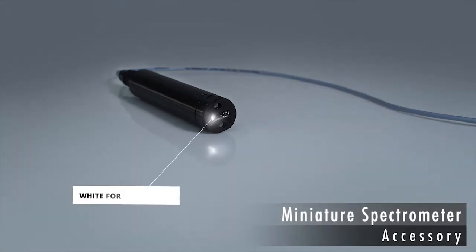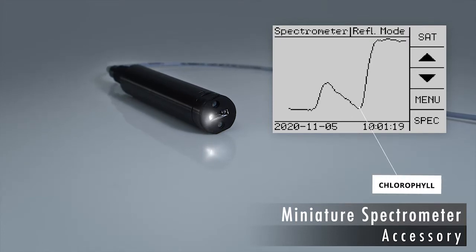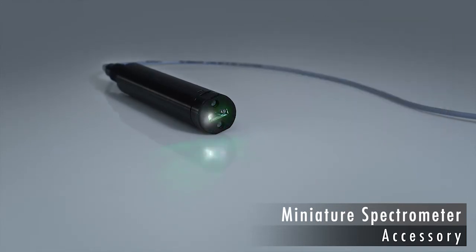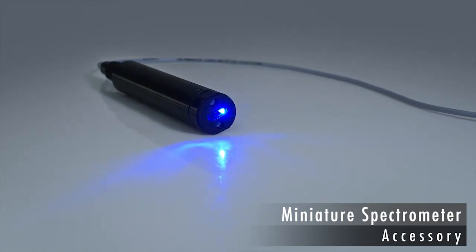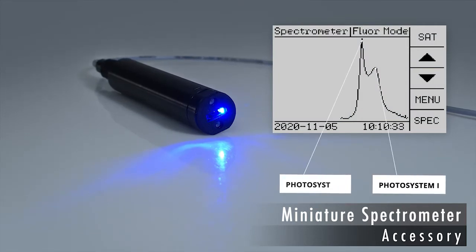The miniature spectrometer can be converted to measure spectra of reflectance or fluorescence emission. For reflectance measurements, a white light source is employed. Reflectance spectra resemble the inverse absorption spectrum of the leaf: the long-wavelength absorption of chlorophyll appears as a minimum, and the green absorption gap of leaves appears as a maximum. A green or blue light source is used for fluorescence emission spectra, whose peaks can be assigned to Photosystem I and Photosystem II.